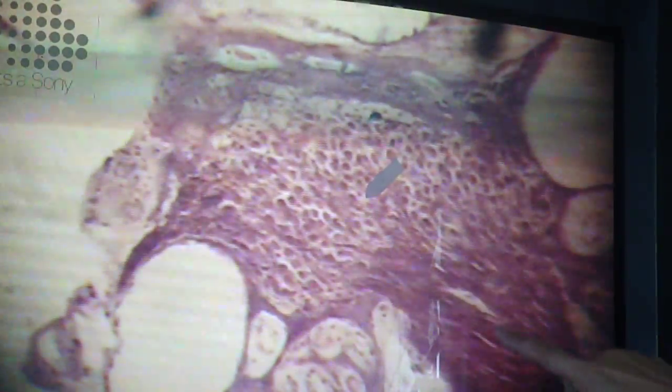So this is the ear. You have to differentiate. This is the consistency of the bone. At the middle, you see, this is attachment. This is your cochlear nerve. If you go up, you'll see this. This is the spiral ganglion of Corti. The axons will join together to form your cochlear nerve.